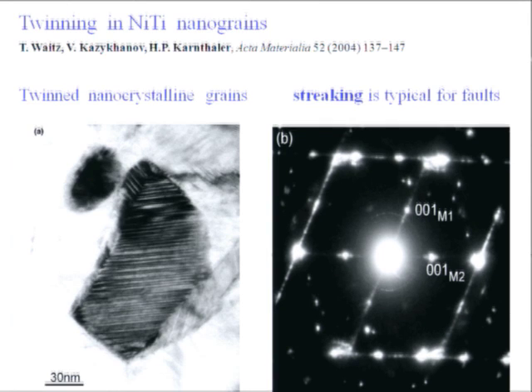This shows a TEM micrograph of a nanocrystalline particle in a nickel-titanium shape memory material, and on the right-hand side you see the diffraction pattern.